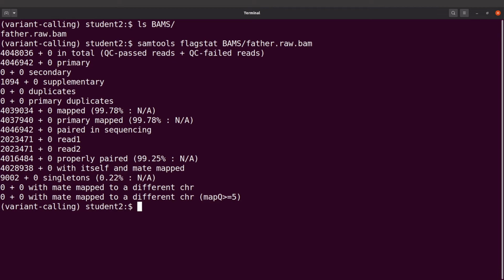Now let's proceed. We have our BAM file generated. What we are going to do next is to filter the alignment records. I made mention of that. Now let's go back to the Galaxy page. I am following the tutorial, so I am trying to make sure I reproduce everything that has been stated in that particular tutorial.